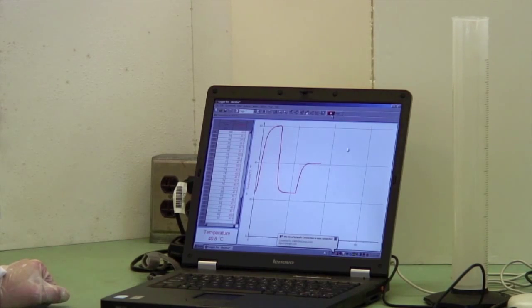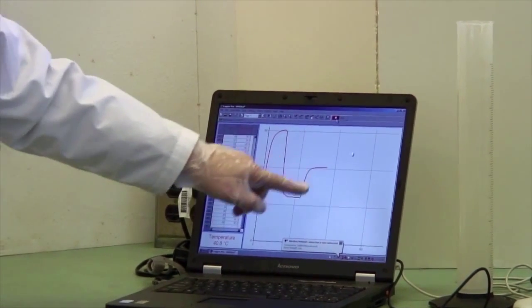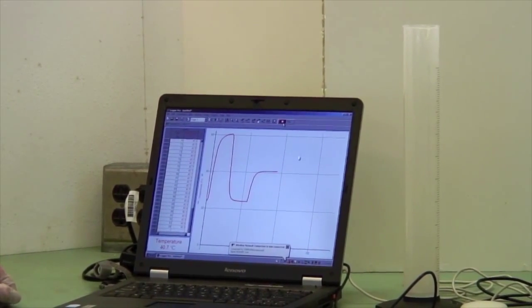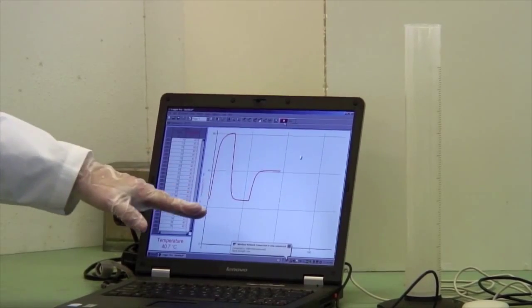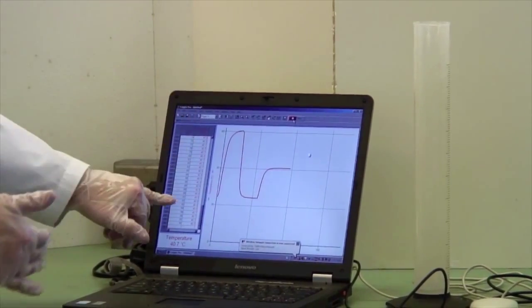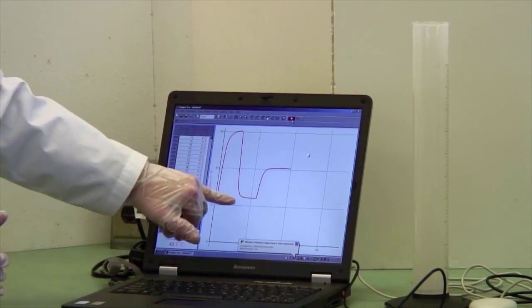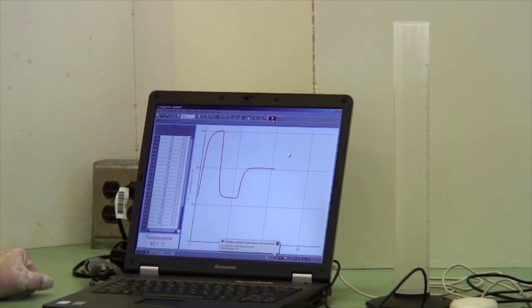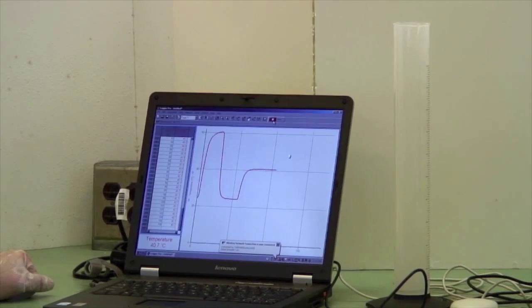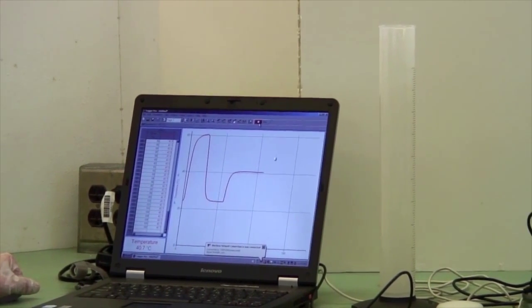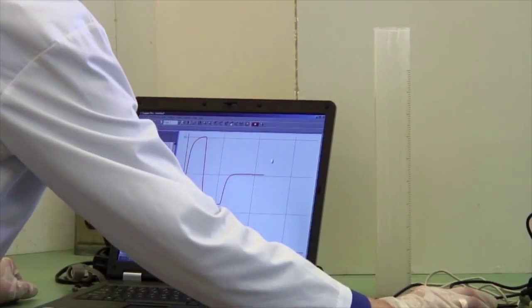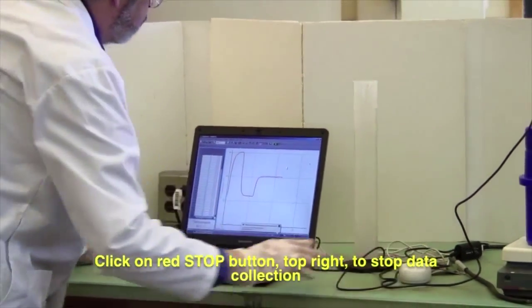Now, you will find that that is not the arithmetic mean of the two. And that's because you took some energy to heat the calorimeter from the cold temperature, 24, up to 40.7. And you use this data to calibrate your calorimeter. You do this three times so that you're sure that you've got some decent data. And now that's finished. And so I click on the red button for stop.